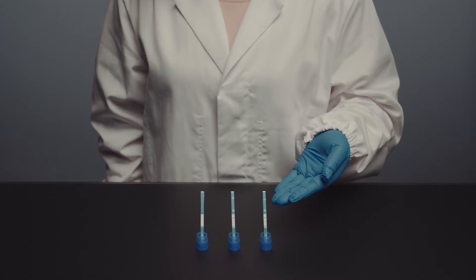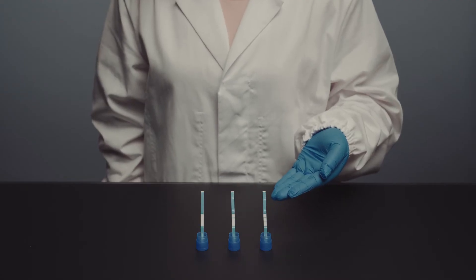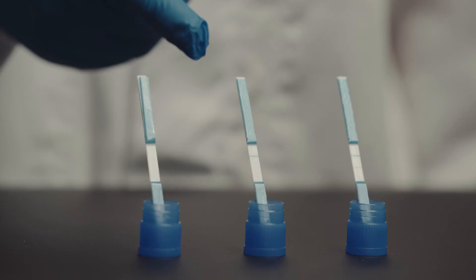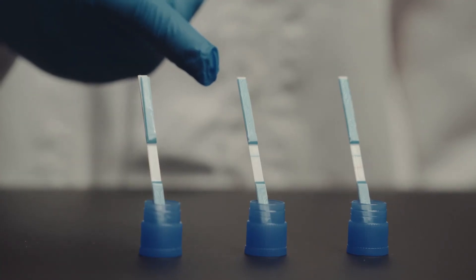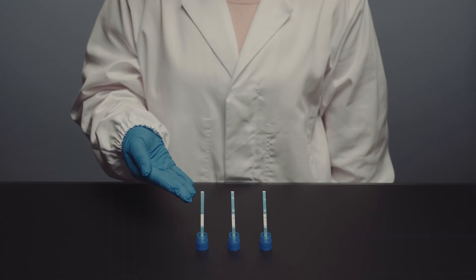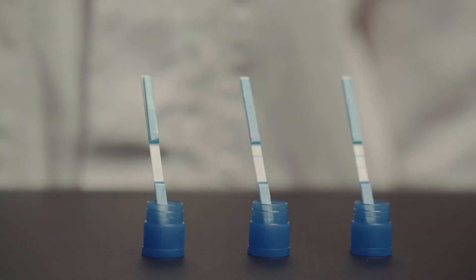If a red and blue line appears, it means that Gluten was detected. If only a blue line appears, it means that no Gluten was detected. And if only a red line or no line appears, it means that the test is invalid.